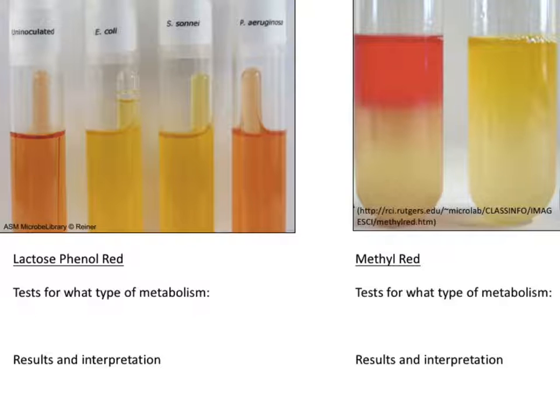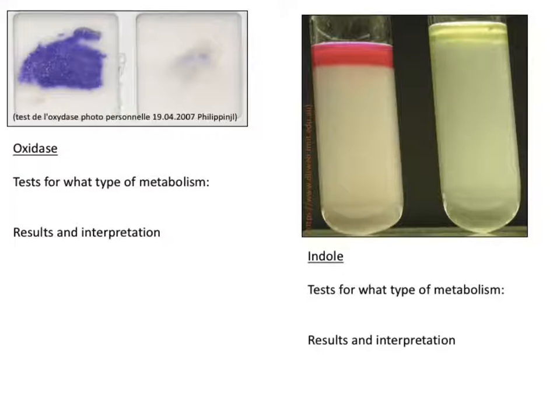Questions on this one? Okay. Let's go to our last bit. Oxidase and indole. What does oxidase test for?